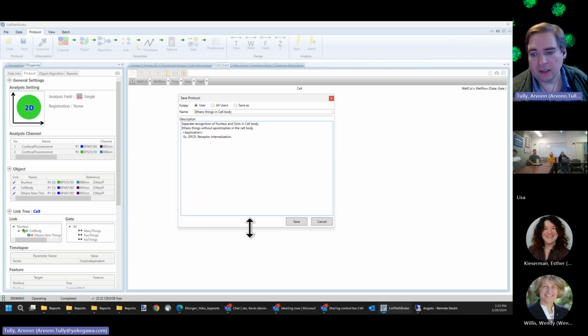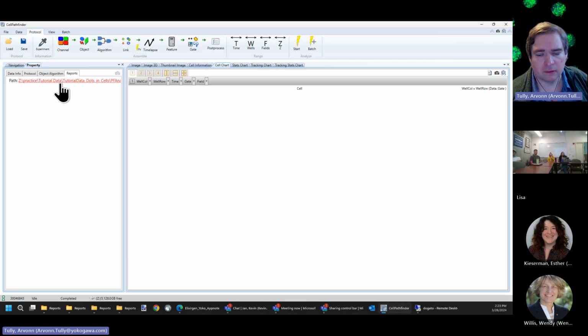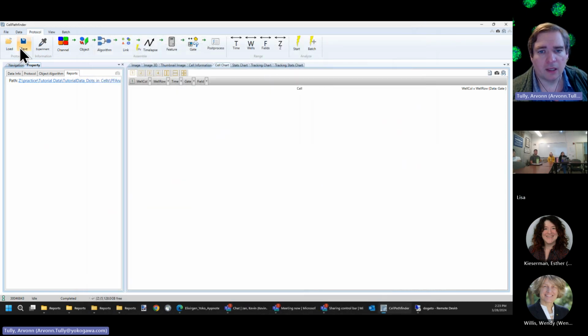So we can save that, and you can put any sort of reasonable description in here. And then that's it. And then in your report, you've got your data. Any snapshots that you've made will be saved here. Everything is here.